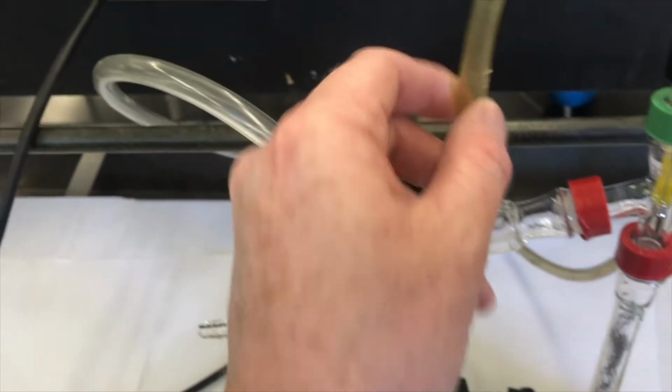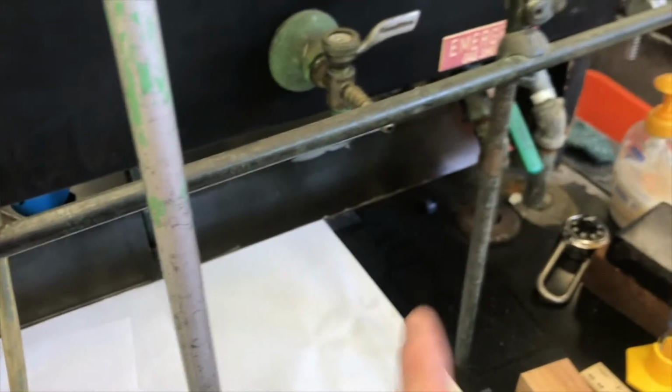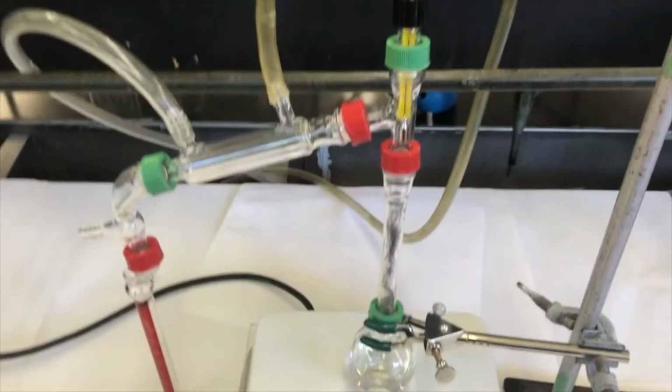If I had other students doing distillations with me, instead of putting it in the sink, I could put it into the top or bottom of their distillation water condenser. You can daisy chain them together. Let's go ahead and turn the water on, see how this works.